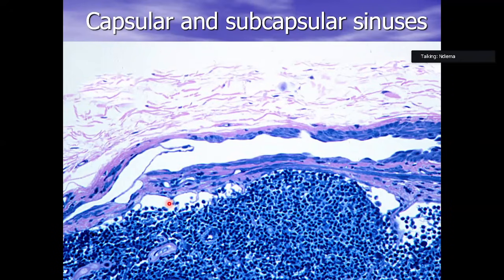We have either a lymph nodule, which are aggregates that are either oval, or diffuse lymphoid distribution, in which case the lymphocytes are uniformly distributed without any sequestration.